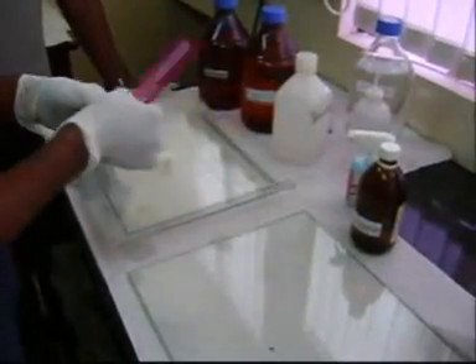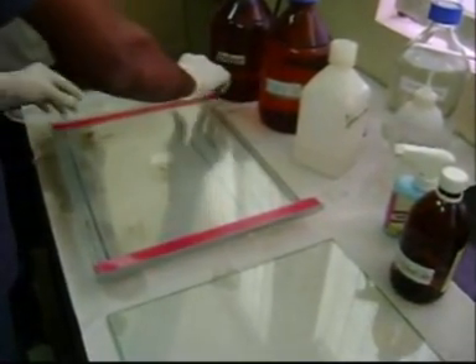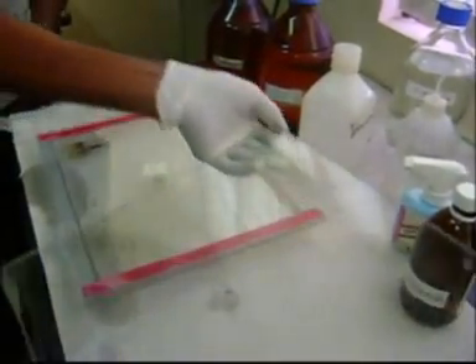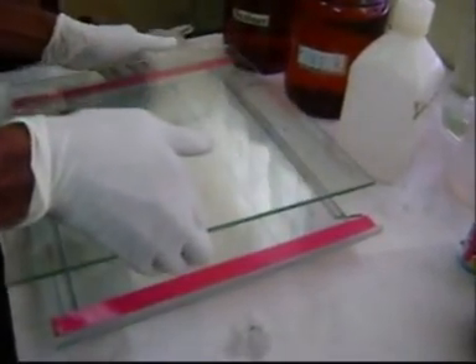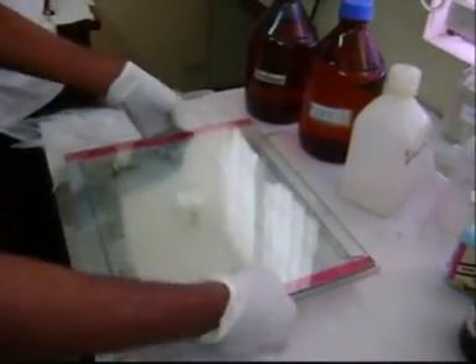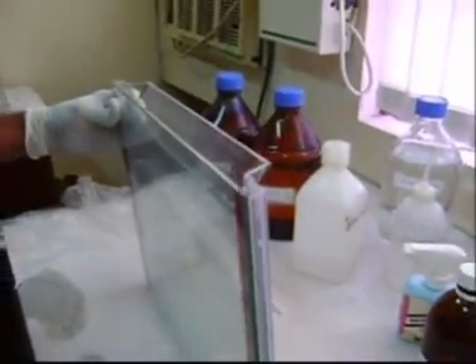Then after a few seconds, place the two spacers at each side of the notch plate. Then take the glass plate and place it on the notch plate such that the clean surface faces the clean surface of the notch plate. Then set the two glass plates with the help of two clamps and fix them properly.